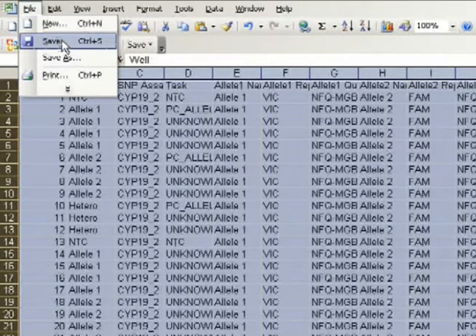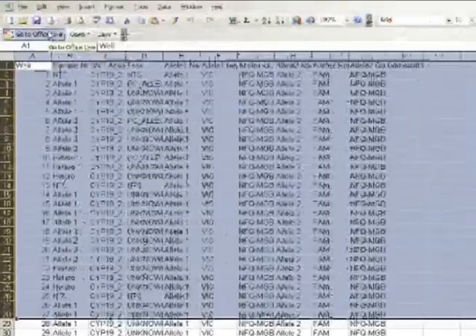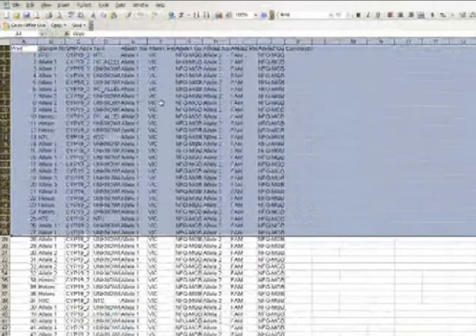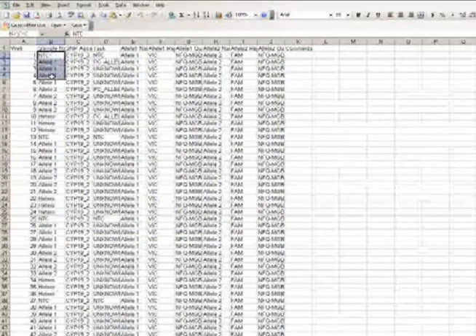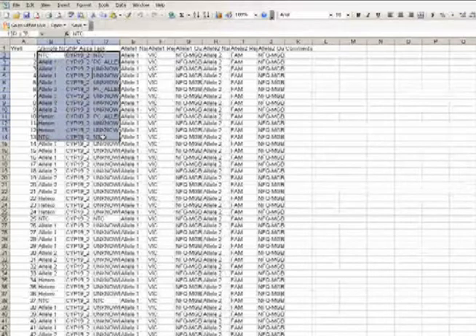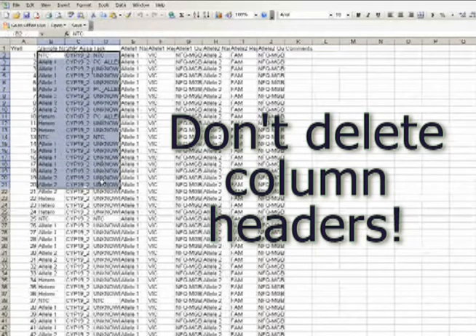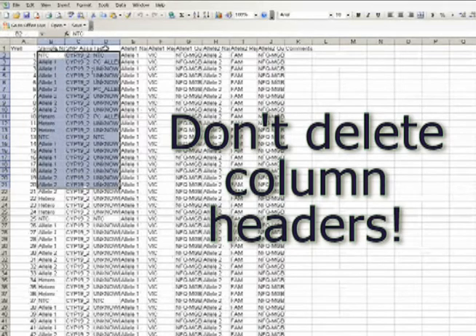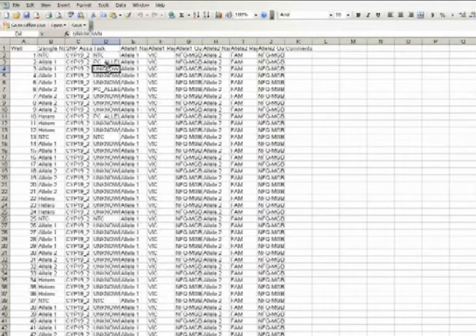At this point, I have all of my column headings in the correct place. I can now delete any information that I won't be using in future runs. In fact, what a lot of users do is clear out the columns for sample names, SNP assay names, and tasks, such that they have a completely blank slate from which to work in the future.